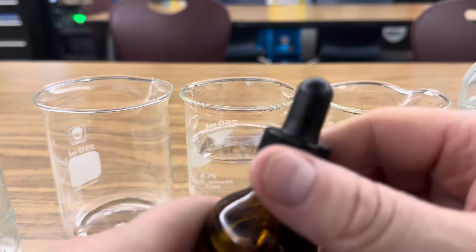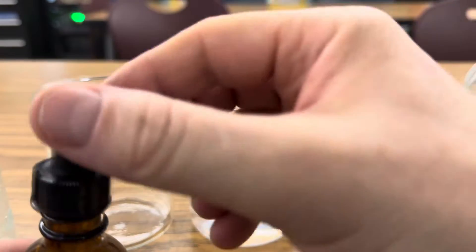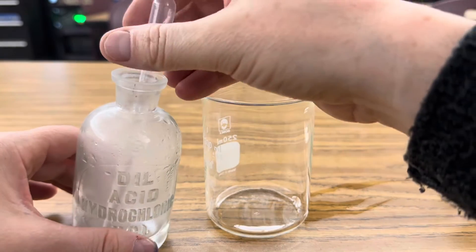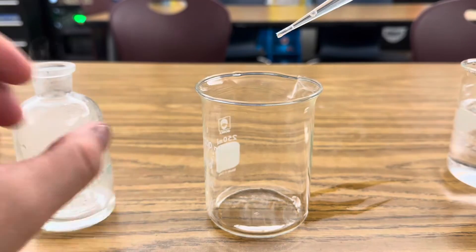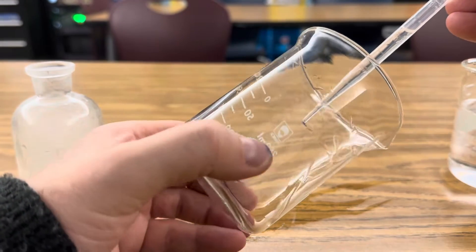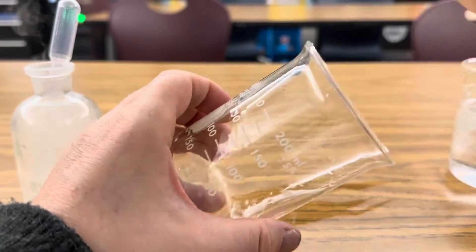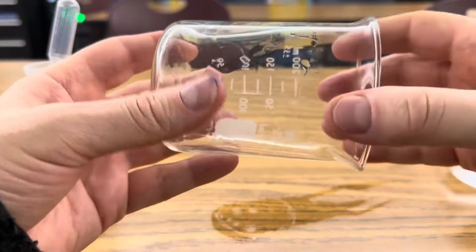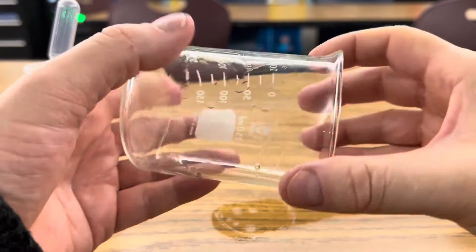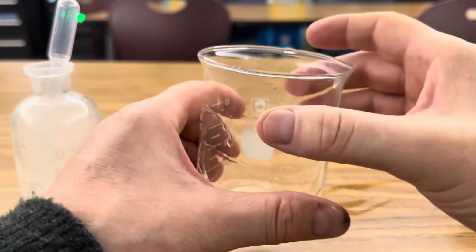The first step is just to add a drop of phenolphthalein to your water. Next, you're going to very carefully take just a few drops of your 12 molar hydrochloric acid and just line the beaker with a little bit of HCl, rolling it to increase the surface area, helping the hydrochloric acid coat the walls of the beaker — so it looks empty.